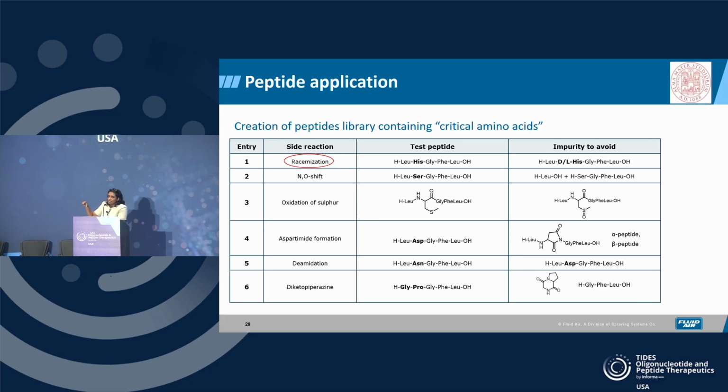And once processed through electrostatic drying, they have shown that none of those impurities were caused, because this goes back to the theory that I was trying to explain, that the peptide is constantly protected by that evaporative cooling, so no impurities are caused.